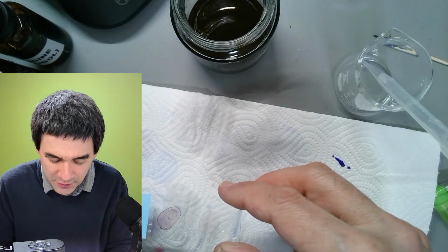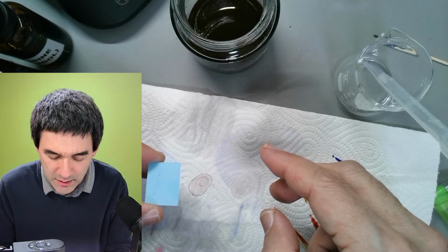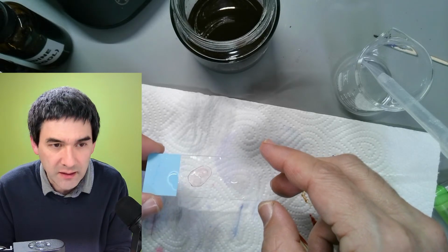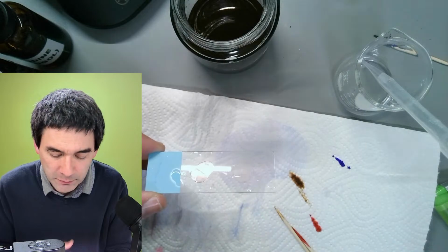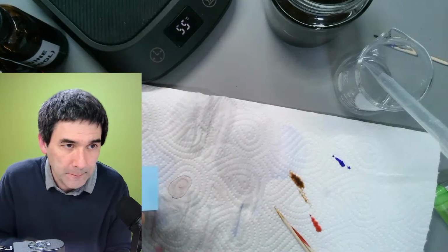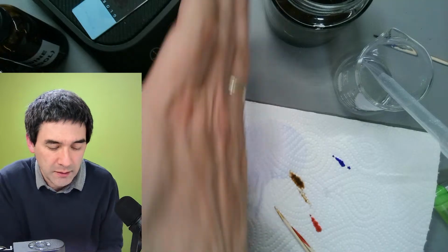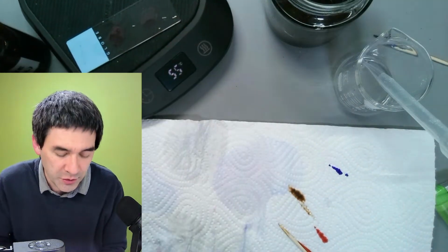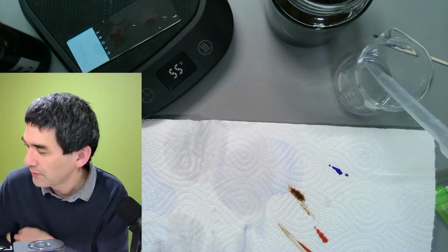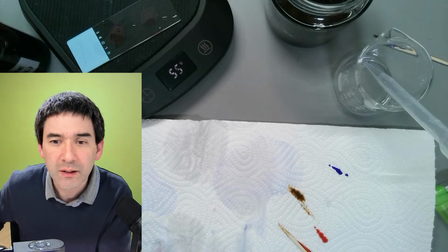In any case, I now want to use oil immersion. So that's the next thing. How am I going to do that? It has to be completely dry for oil immersion microscopy. So I'm going to put it again on my coffee warmer for a minute or so, simply to evaporate the water, because I want to go up to the maximum magnification.